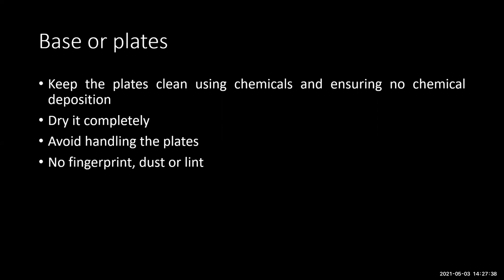So this ensures that there is no fingerprint, dust or lint deposited on the plate. It's very important that once it is dry, you wrap it completely with lint-free paper to ensure no deposits are formed. Now let us go into the stationary phase.